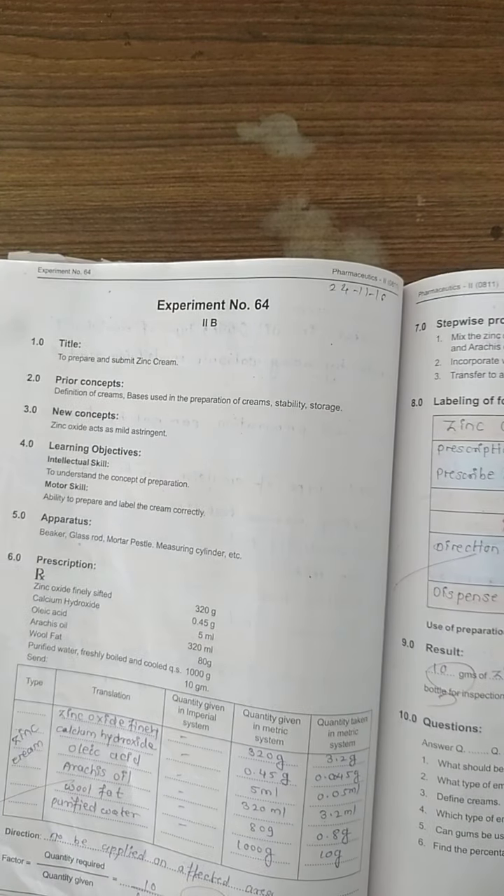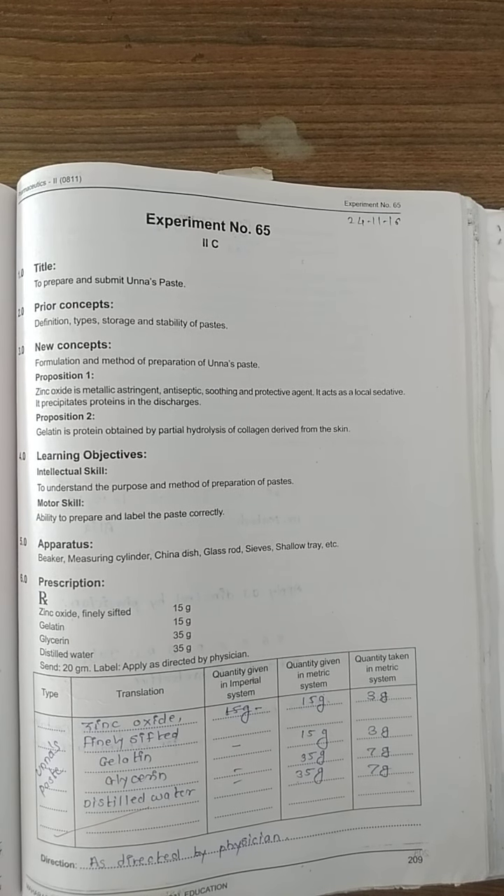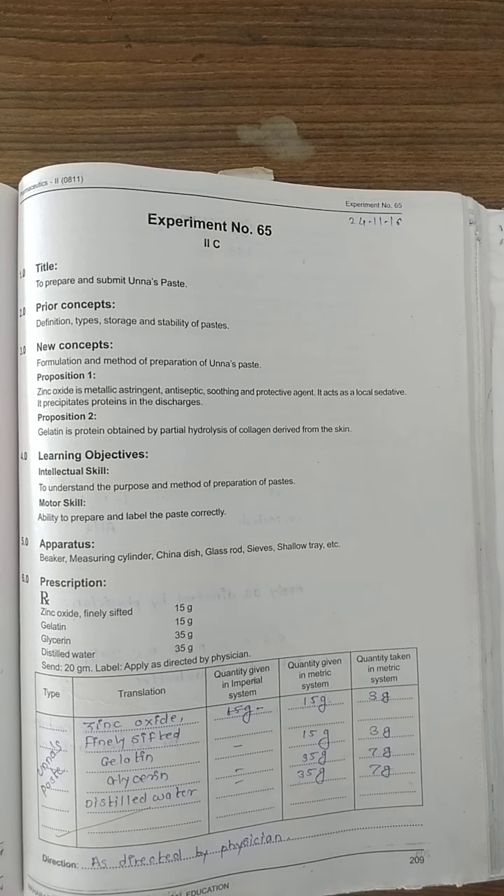Experiment number 65 is next. Here we have to prepare a paste and submit it. We now revise the semi-solid dosage forms: oils, pastes, and jellies. Paste means a semi-solid preparation for external application to the skin, but it is thick and stiff — it will not melt at ordinary temperature, unlike an ointment which would start to melt.